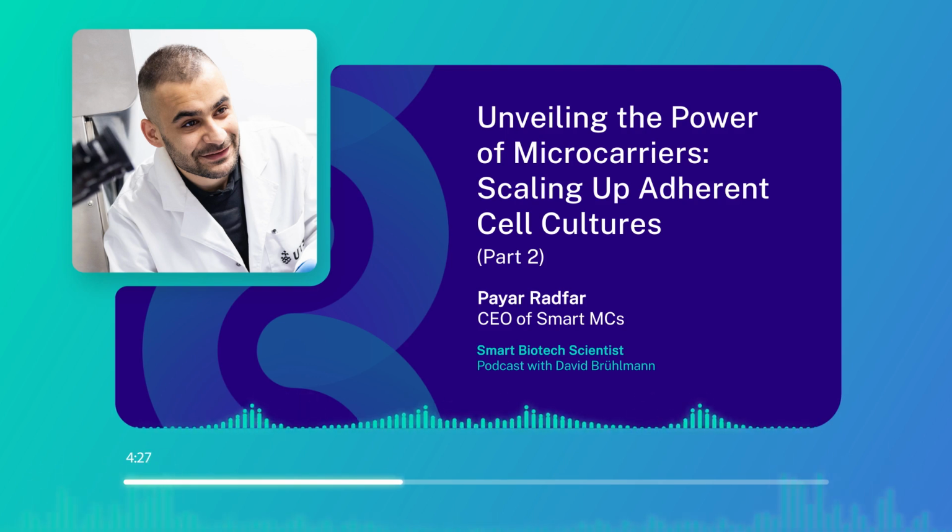So I think pretty much it is understanding that every cell type, every type of bioreactor, every type of microcarrier, they're all different. So the biggest pitfall, I guess, people tend to make is, okay, we did the first type and now it's going to be the same for experiment 2, whereas it might not be.